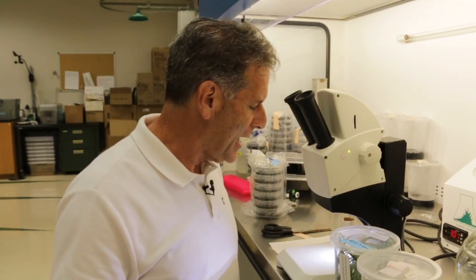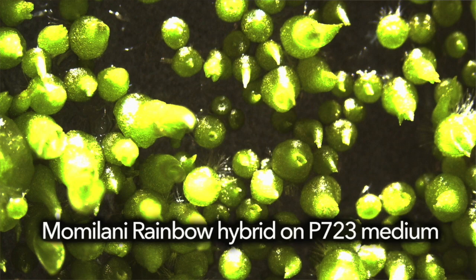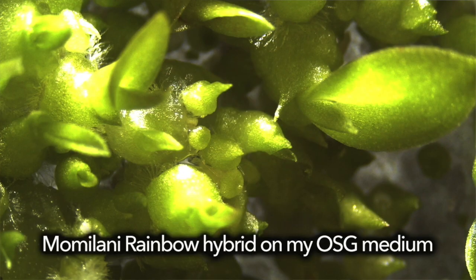The next one is another cattleya cross with one of my plants that is incredibly vigorous — Momilani Rainbow. These seeds were plated about two months ago. The first image shows the P723 standard medium that most people use in the laboratory — there's decent protocorm formation and you're starting to see some leaf formation. Then shifting to my orchid seed germination medium, the seeds from the same cross and same capsule show much larger protocorm formation and leaf development that is much farther along.